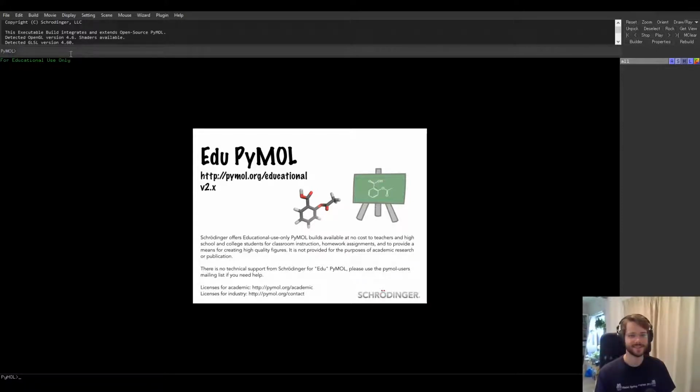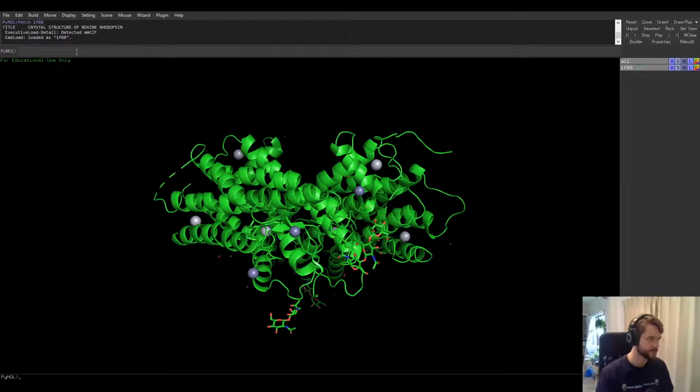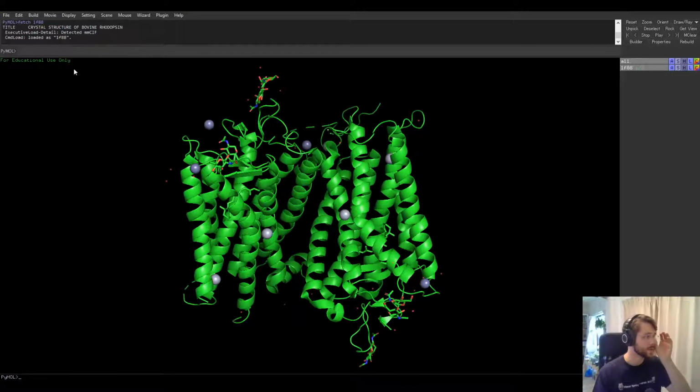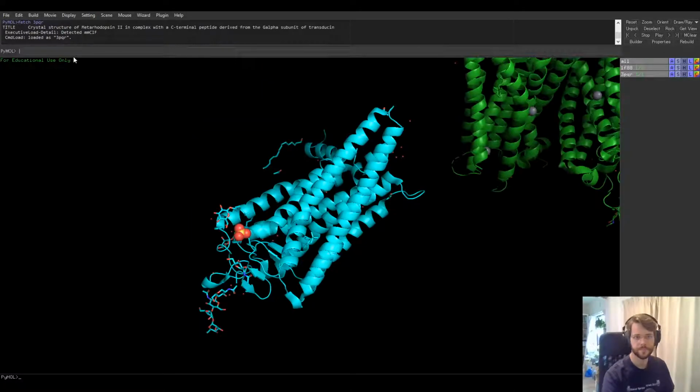Okay. So as mentioned, the two proteins that we need today are 1F88. So we're going to type in fetch 1F88. Very nice. And we also need another one. It's called fetch 3PQR. All right.